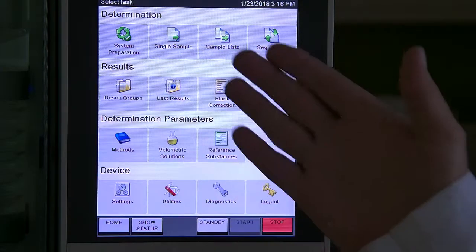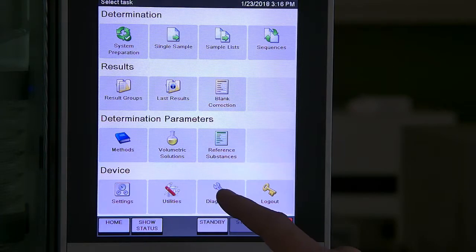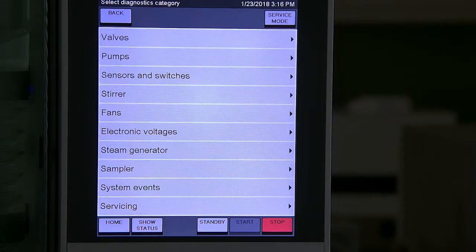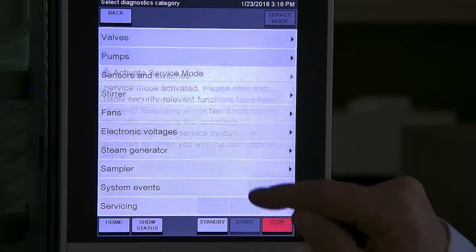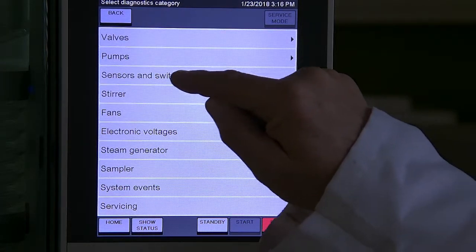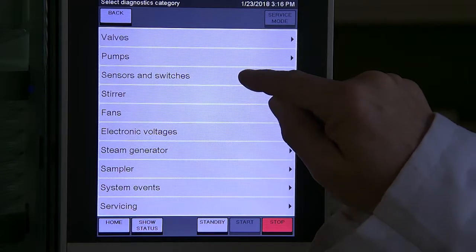Here we have again the home screen. We're going to go to diagnostics, we're going to go to service mode. We are going to say yes and here we are going to look at the sensors and switches.